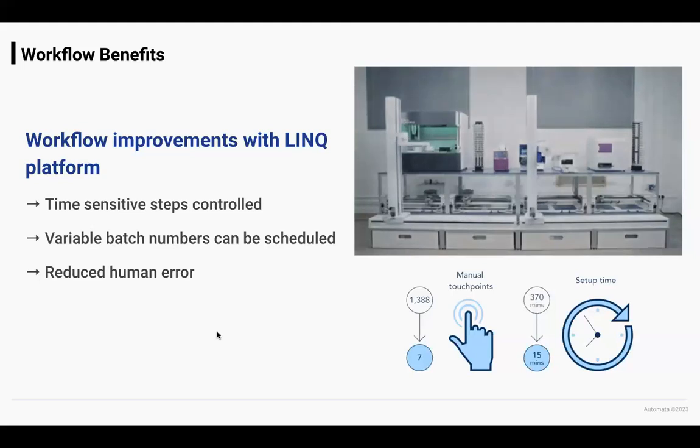And then also there's that bit about human error. You're never going to misload a plate. You're never going to flip the plate before you read it and then find out once you've got your sequencing results back that everything looks very unbalanced. Again, that's a personal story. So that's our QC workcell.